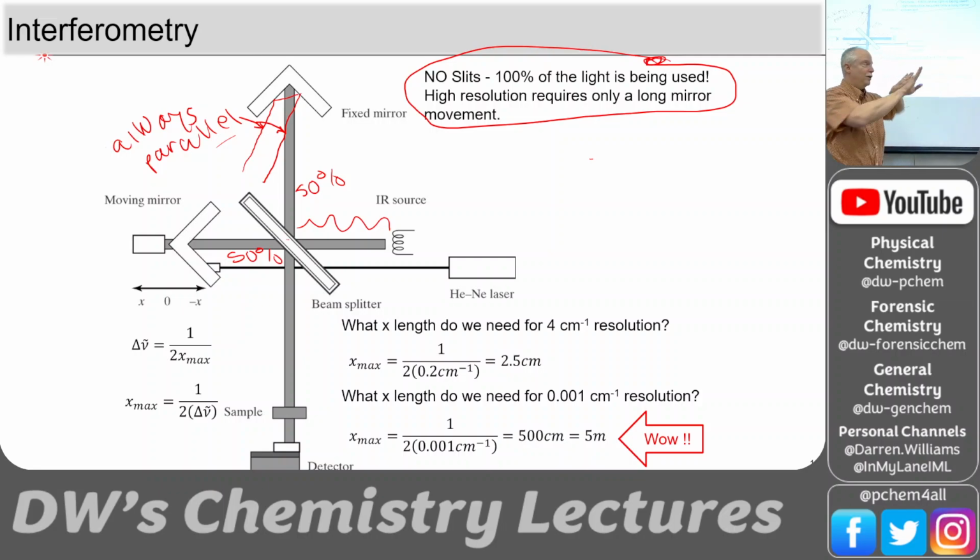And so when you're looking in the mirror and you've got the two mirrors next to each other, whatever angle you're at, it comes back parallel. And so that's why you can't get out of the corner when those two mirrors meet. This is just a great way to make sure that whatever light hits that mirror comes straight back in a parallel path.